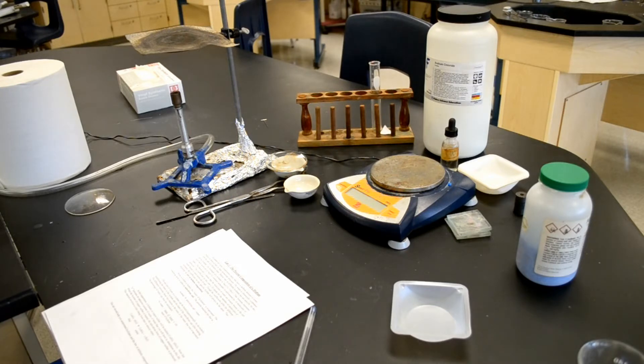When the hydrate of copper sulfate is heated, the anhydrous form of copper sulfate is produced. This reaction involves a color change from blue to almost white. Where CUSO4·XH2O is blue and CUSO4 is white plus X moles of water. This lab should help you understand hydrates and the law of definite composition.